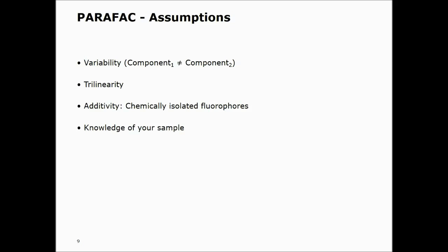Secondly, we also assume trilinearity. That means that emission spectra are invariant across excitation wavelengths, and excitation spectra are invariant across emission wavelengths, and that the fluorophore concentration increases approximately linearly with the fluorescence intensity.